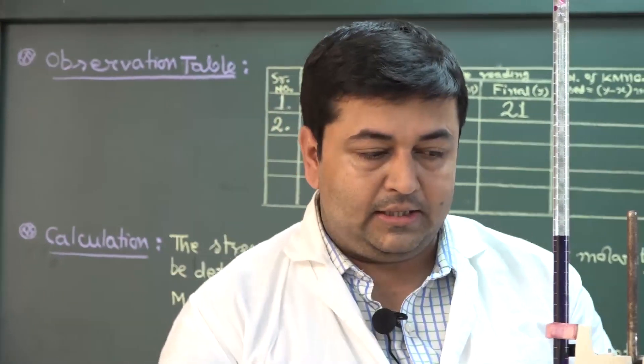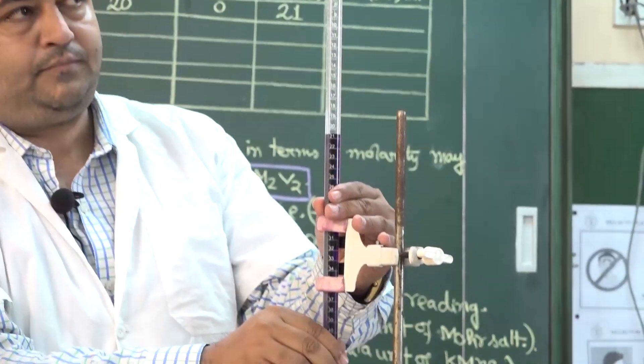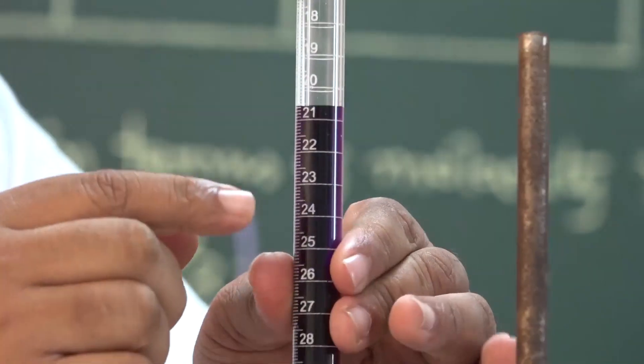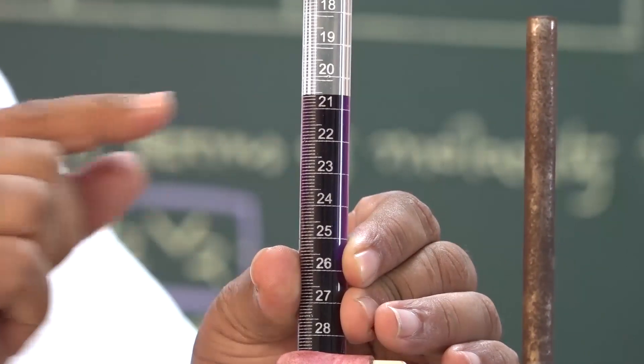Now let us see the final reading of the burette. The initial reading was 0, and the final reading is 20.5 ml.